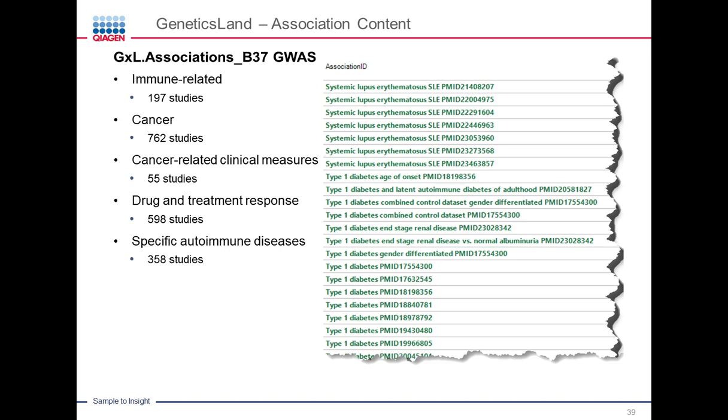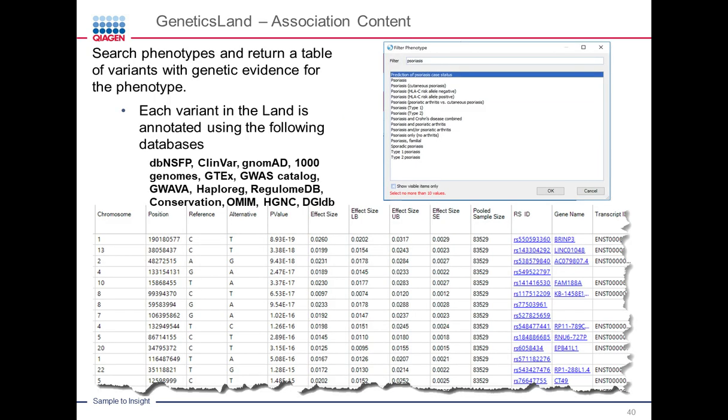And for the genetics lands, it's important to point out data consistency and standardization. So in these lands, you can browse across the different studies at the same time based on the fact that we have performed allele standardization. And so you're really able to explore and filter down from those association hits based on the fact that you can query across different studies at the same time.